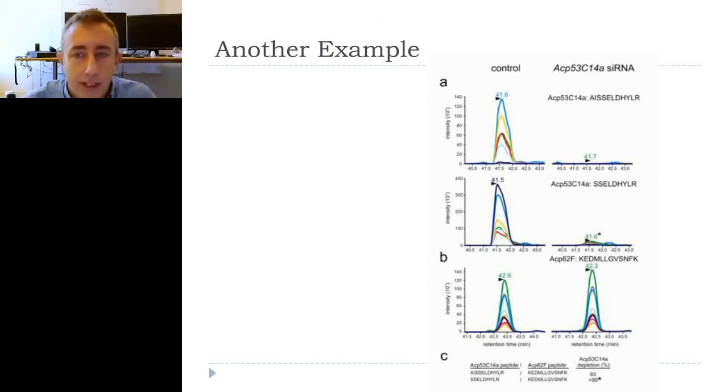We did this for several other cases too, and of course, just like you can have an antibody to multiple different domains of a gene product, you can measure multiple different peptides to provide different confirmation, maybe different isoforms or splice variants, etc. So here we measured 2 different peptides for this individual gene product, which provide independent confirmation of knockdown. And again, we had a different loading control.